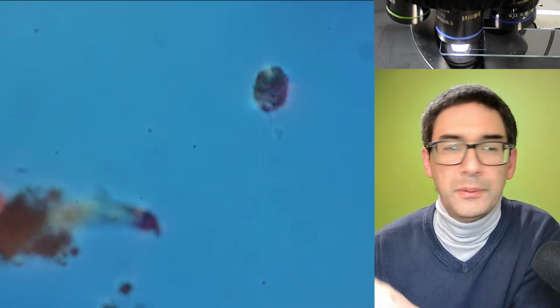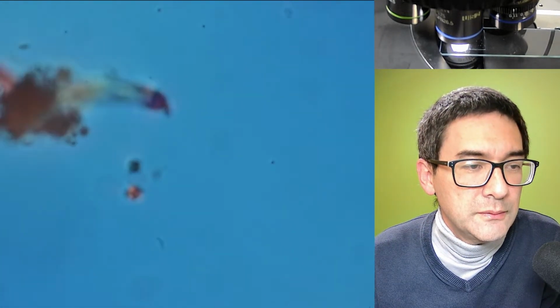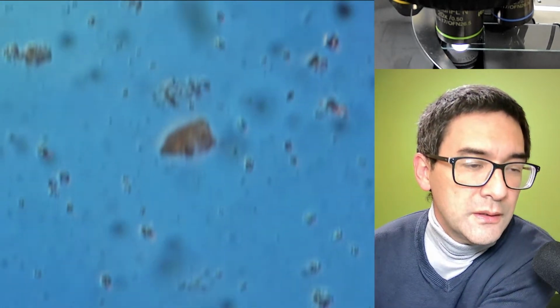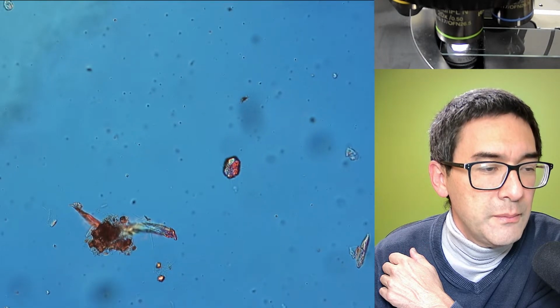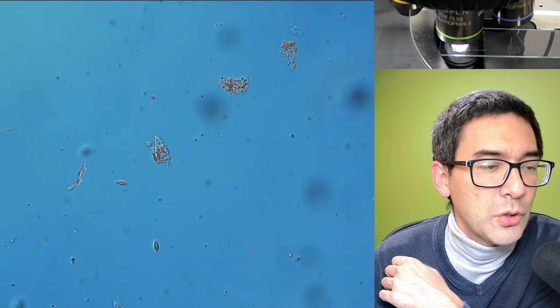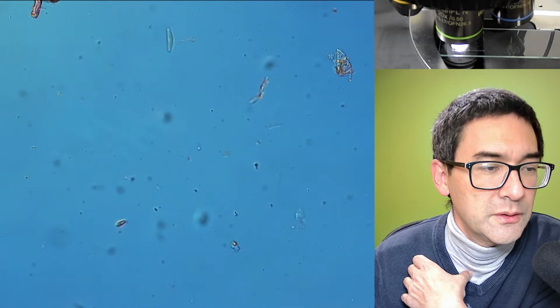And it will then be taken up by the capillary action. And let me go down a little bit with the magnification here. So this is here at the top, this is where I applied it, right? And the capillary action is drawn in. We can see that there are lots of these particles now here, and the further we go away, we see that there are none of them anymore, and here they start. Yeah, and usually what I do is I observe what happens to them, when some of them start to move back to the higher concentrated area. If they do that in the first place, if they do that at all.